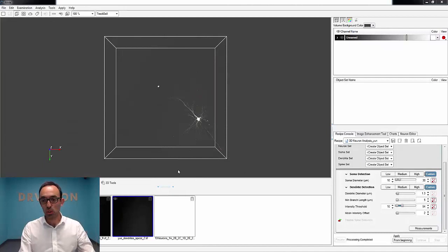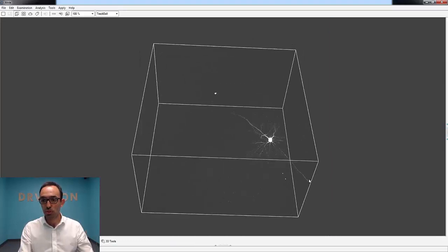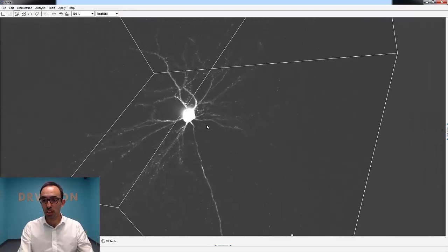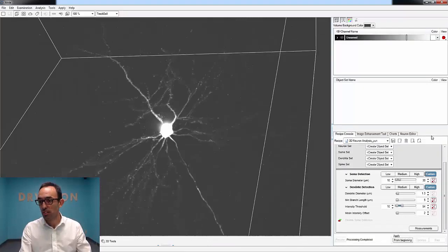It's in the mode very much the same as what you saw in the PowerPoint a moment ago. This panel on the bottom is collapsible, as is the one on the right hand side. And that's very useful when you already have the results and you want to explore them on your flat screen, so you have more space to look at the results. That's why we have it this way, so you can collapse everything.